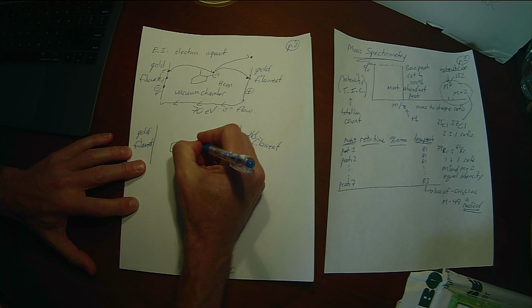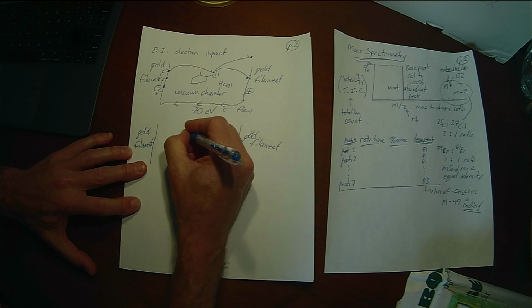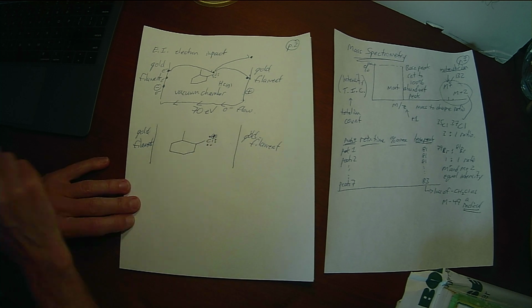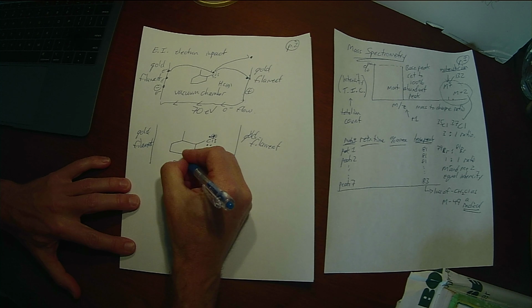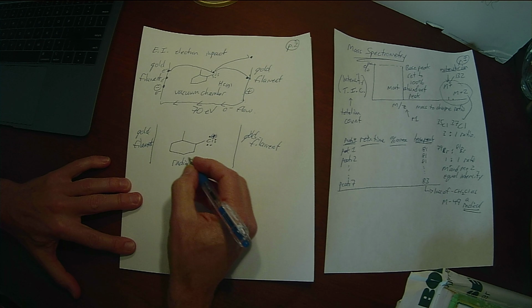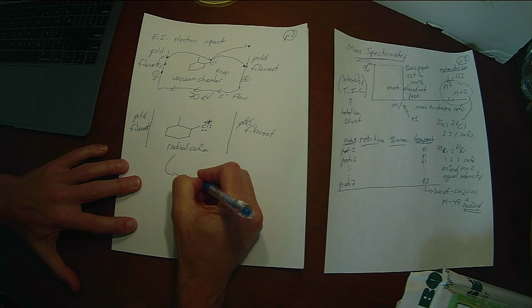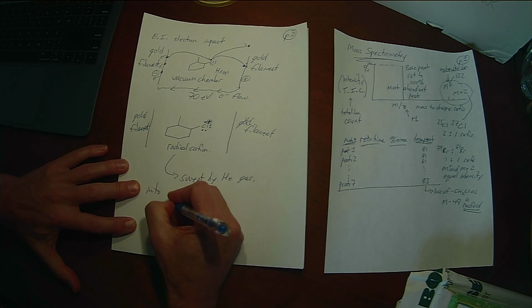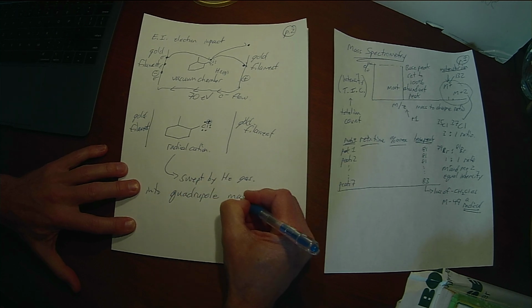And what we will have done is created an electron deficient species where one of the highest energy electrons, which is often a lone pair, if you have lone pairs in the molecule, generally one of the lone pair electrons is the one that's gone. So what we have here is a radical cation. And that charged particle is now swept by the helium gas into what we call a quadrupole mass selective detector.